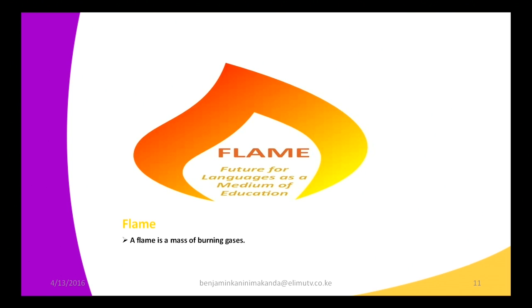Are you able to identify types of gases that mix with the air to burn and give us flame? Maybe at a later stage, we'll have gases like methane, ethane, butane. They mix with the air, and in air we have oxygen, then ignited to produce what? To produce a flame, which we are seeing here. So it's right to say that a flame is a mass of burning gas.